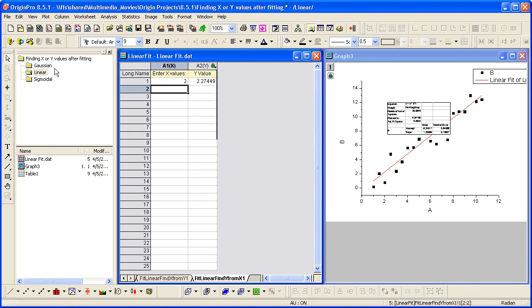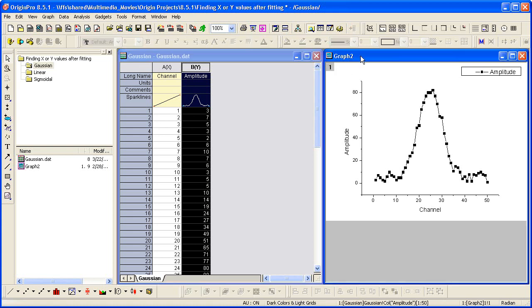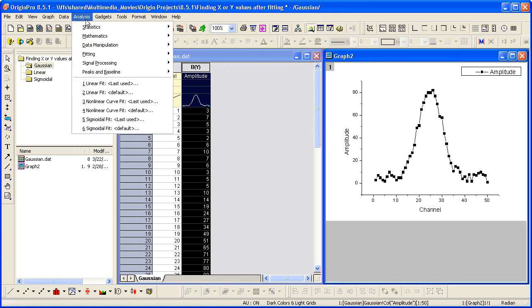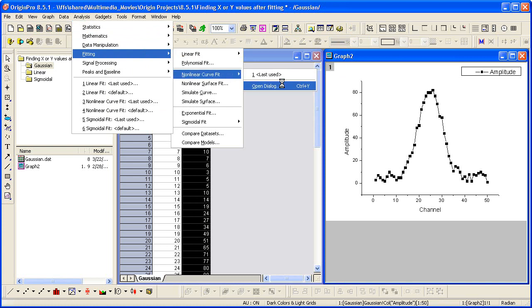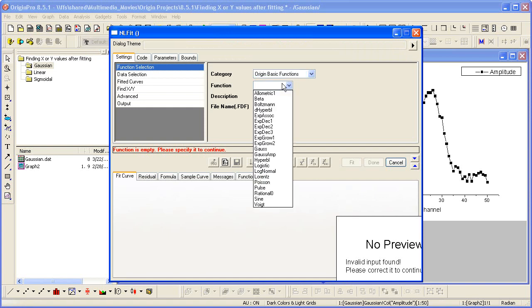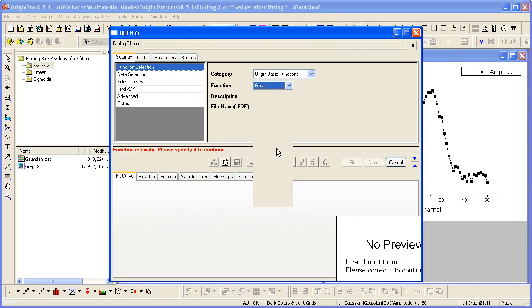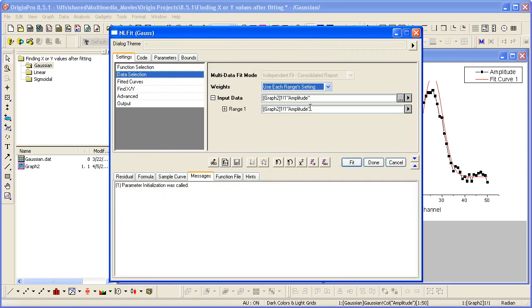Let's go ahead and look at another example. Here we have some Gaussian data. To fit this, again I'm going to start from the graph and then select analysis fitting nonlinear curve fit. In the dialog that opens, I need to choose a function. So I select Gauss as my function. Then for data selection, notice the input data is again automatically assigned as the active data plot.